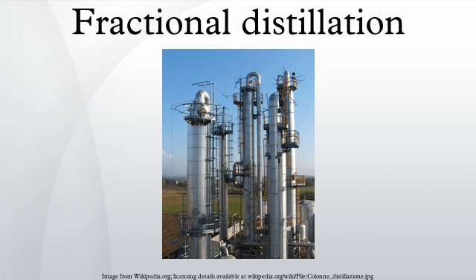Laboratory setup. Fractional distillation in a laboratory makes use of common laboratory glassware and apparatuses, typically including a Bunsen burner, a round-bottomed flask and a condenser, as well as the single-purpose fractionating column.